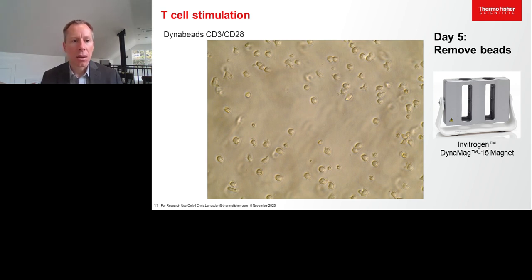into our downstream experiments. Now, at this point, in this example, these cells have been out of a human now for 5 days. And so we'd like to do a quick quality check to see how healthy are they, have they died, or are they viable, and is it a good idea to carry these on into our downstream assays.